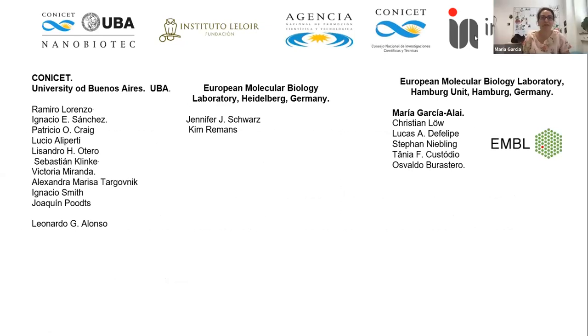Thank you, Leonardo, for the nice talk and all the results that you are showing. We have some questions from Eva Hyde. It says, deamidation can be seen by 13C NMR and 13CO spectra. The peaks for the aspartic are very different from those from asparagine. Can you do this with part of the protein? Yes, but the data about NMR of the receptor binding motif, just this domain, are very scarce. And of course, for a large protein, NMR is quite difficult to do. So yes, we can evaluate the deamidation using NMR, but this is limited to a small protein or domain. It's not the case of the spike protein.